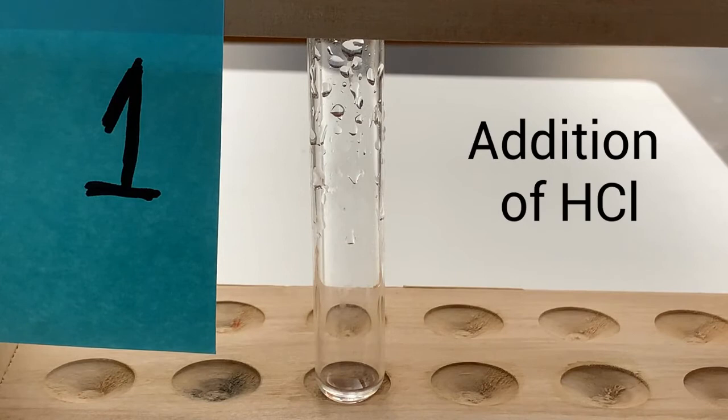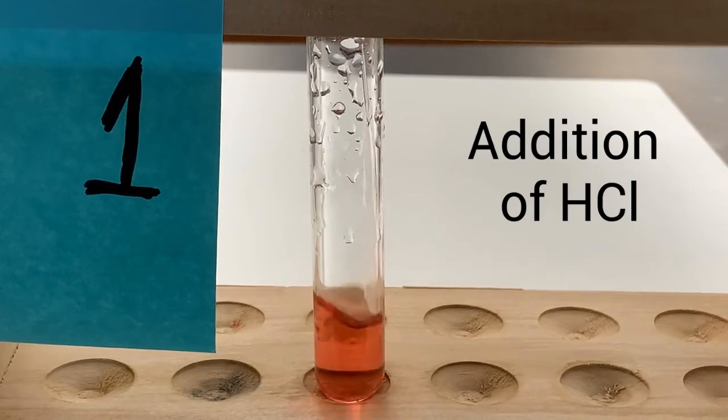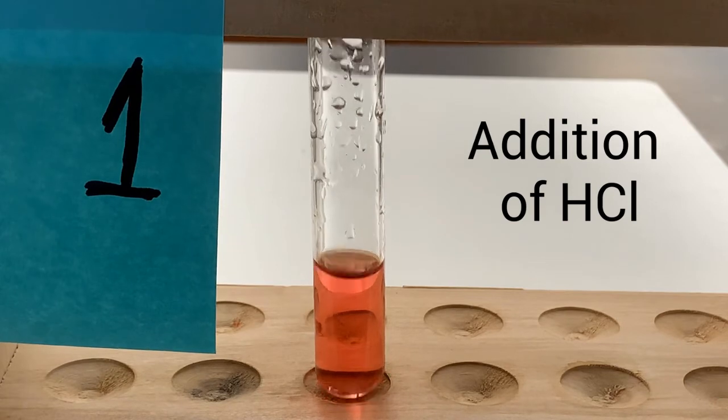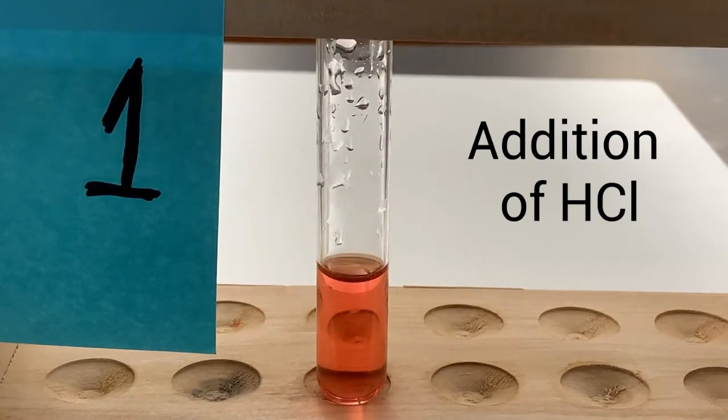This is test tube number 1. To this, I'm going to add some of the cobalt chloride solution, which we can see is sort of this reddish pink color, before I do anything else to it. And to that, I'm going to add hydrochloric acid.